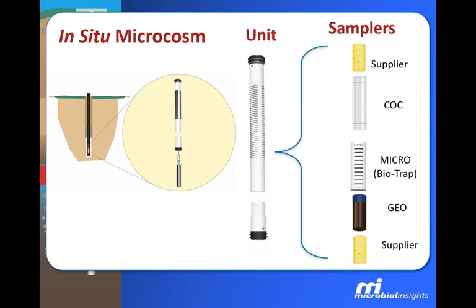Now, one of the properties of these beads, since the Nomex is so heat tolerant, is that these beads can be heat sterilized up to 270 degrees C. So the big advantage here is that not only can we sterilize these beads, but since we can preheat them to such high temperatures, we can basically drive off any organics that are adsorbed to the activated carbon and burn off or destroy any biomarkers that may be present in the bead.